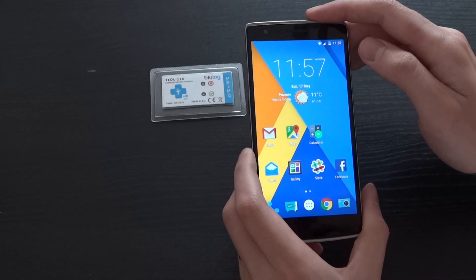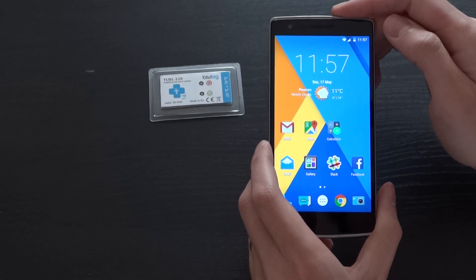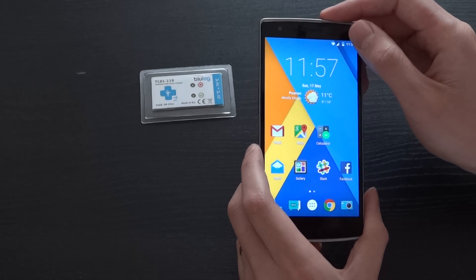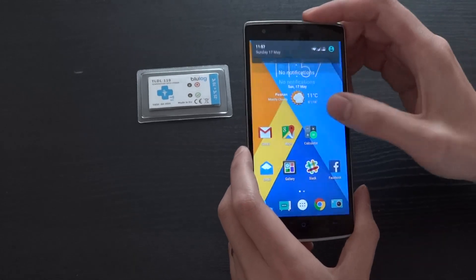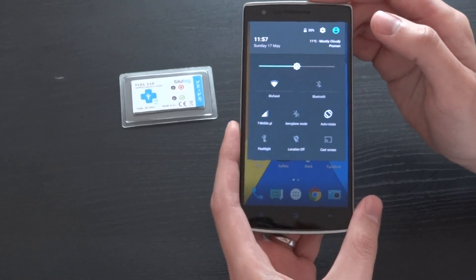This is an introduction video of how to use the BlueLog NFC temperature data loggers. To start, you need to activate NFC on your Android smartphone.